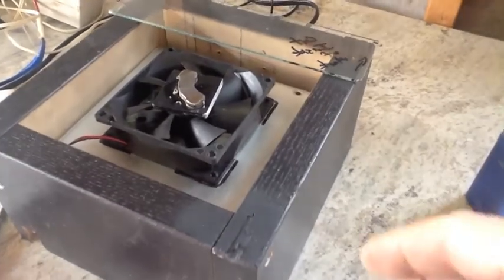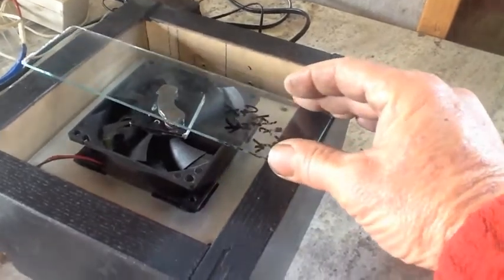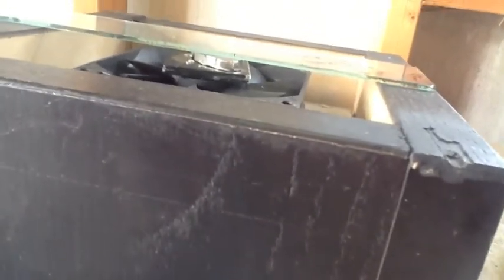Everything is cemented down and I was quite pleased because I put my glass back over and we've still got a little bit of clearance — not much but we've still got a little, and a little is all I need. As far as I'm concerned, I'm good to go.